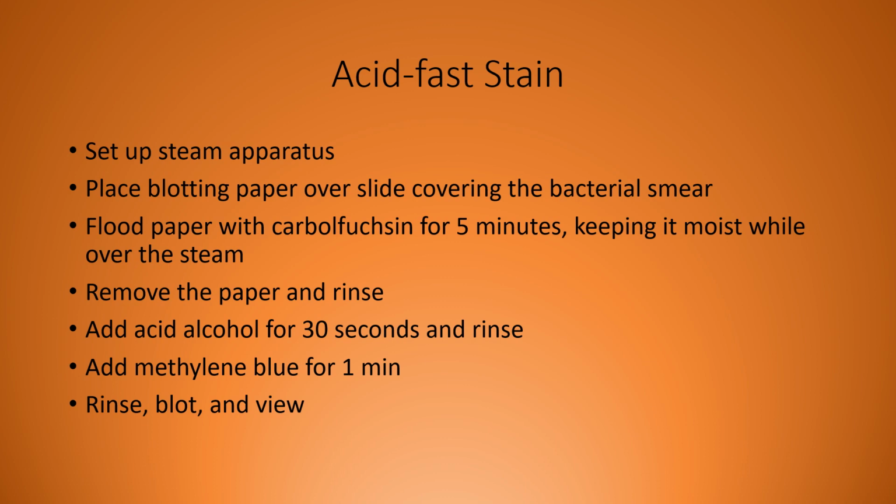You've got the slide, you're going to put the blotting paper on it, and then on that blotting paper, just flood it with the carbolfuchsin, the red dye. You need to leave it on for 5 minutes. The entire time you've got steam coming up from underneath the slide, heating it. You have to watch the slide the entire 5 minutes.